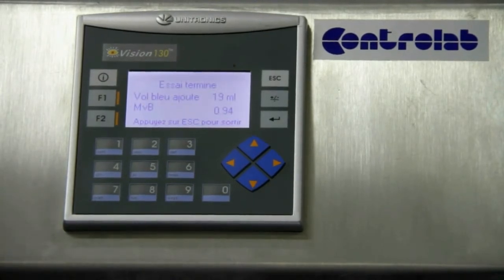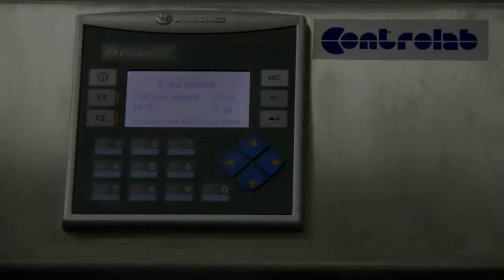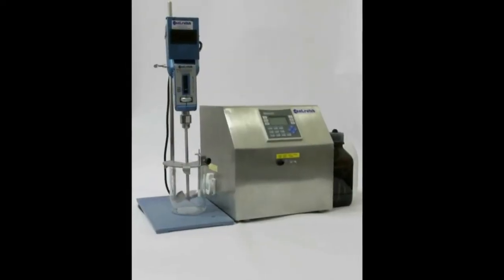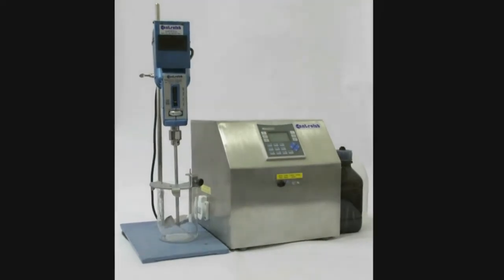This complete device allows you to realize your methylene blue and VBS tests. Automated maintenance protects your device and ensures your quality tests.